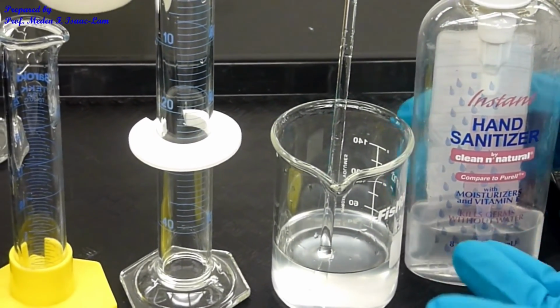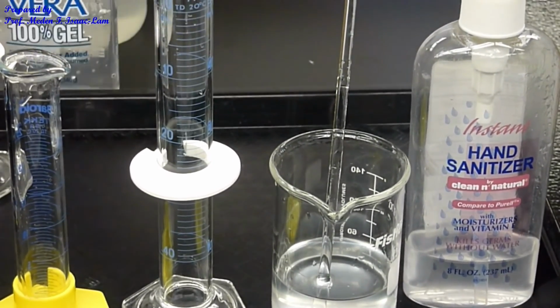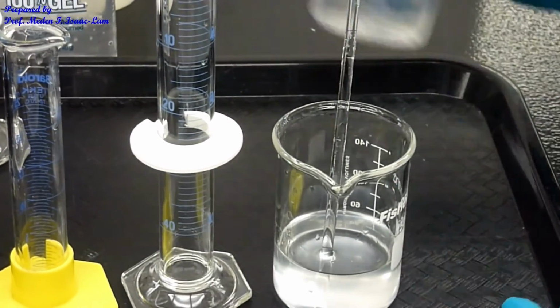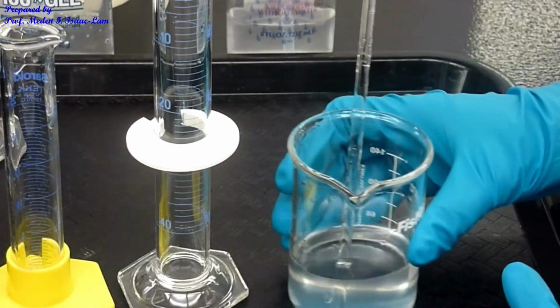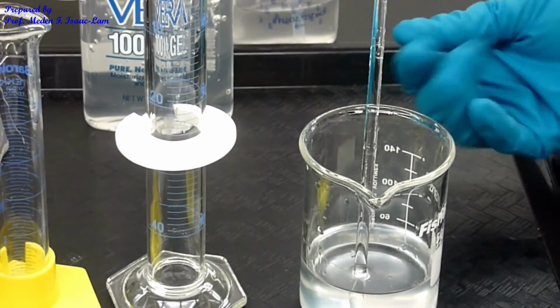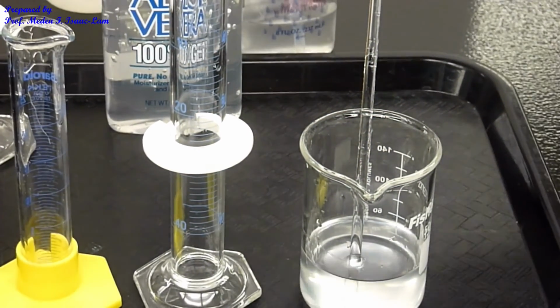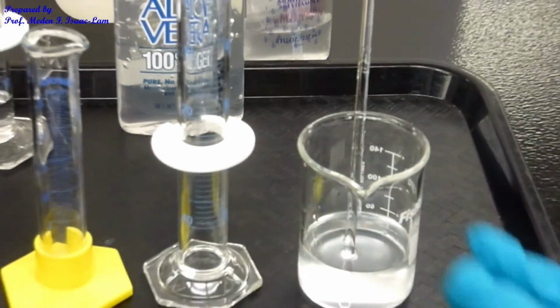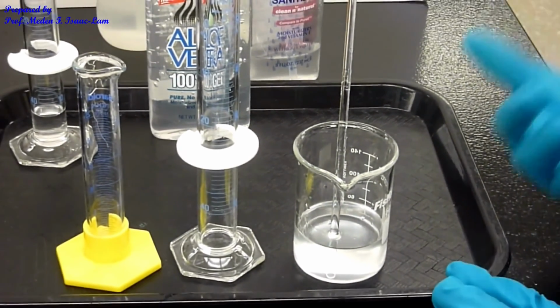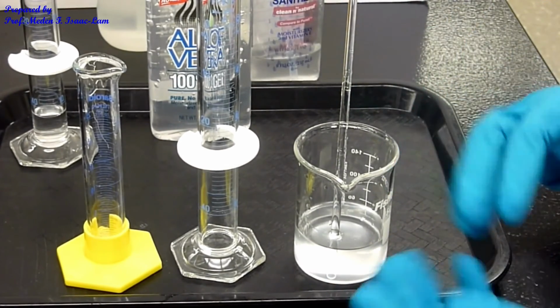So we made a hand sanitizer with the aloe vera gel in here, and you can do this at home. At home, you can buy this, and you can buy ethanol. However, because you probably don't have a graduated cylinder, you can just measure with your laundry measuring cup.